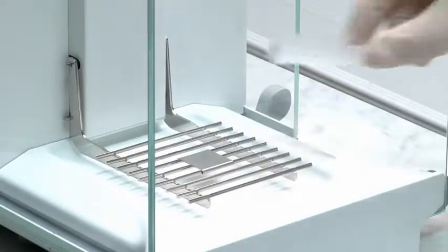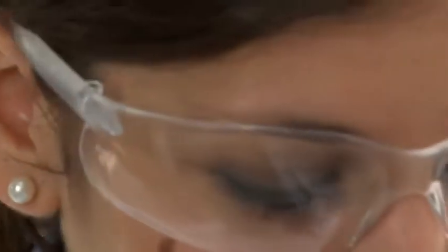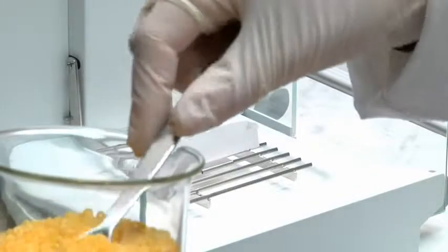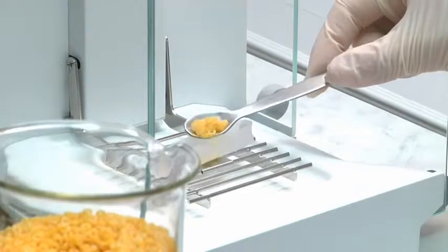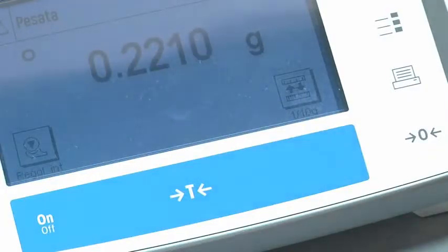Kjeldahl analysis is ideal for solid, semi-solid, and liquid samples. Homogenize the sample totally, weigh and transfer it into a VELP glass test tube along with catalyst tablets and reagents according to the official method.